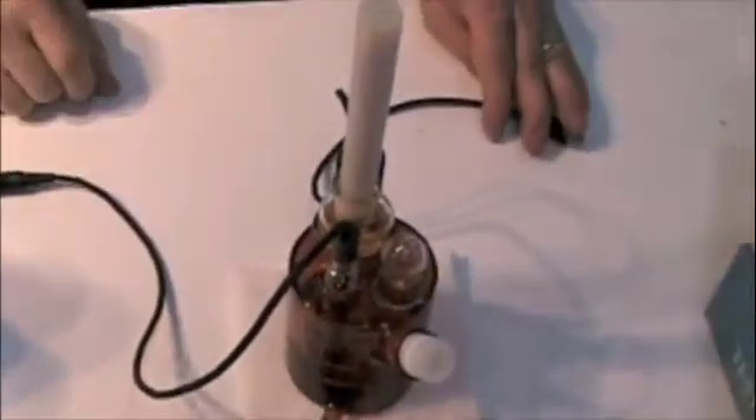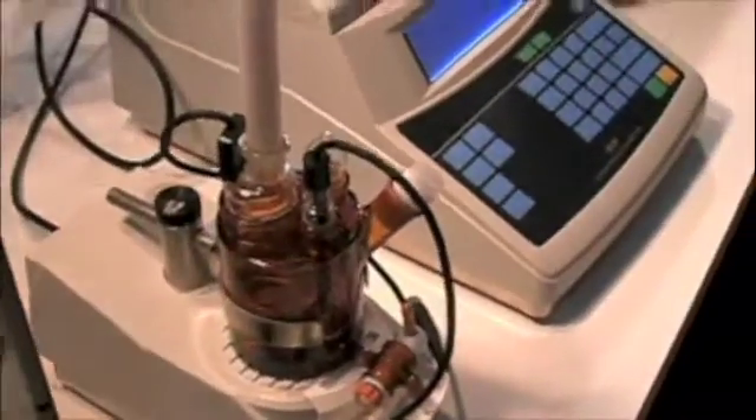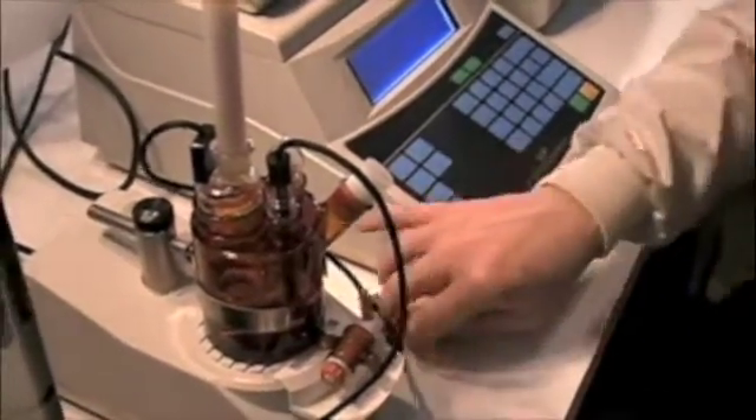We have our desiccant on top. Now that the vessel is charged, we're going to go ahead and place it on the stand and plug in the leads. This is the generator electrode, and they're both connected.